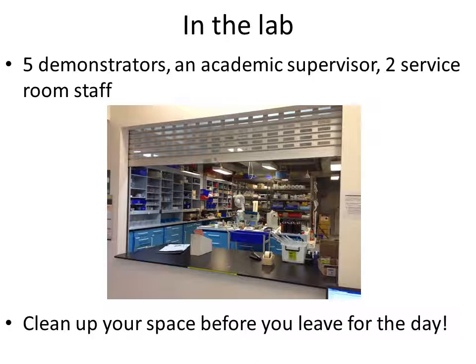You must clean up your lab space before you leave and leave it looking the same as when you came in. Students the next day will be using the same equipment and glassware as you, so you need to make sure that things are neat and tidy for the next lot of students. If you leave without cleaning up, you may be penalised 10% of your mark.